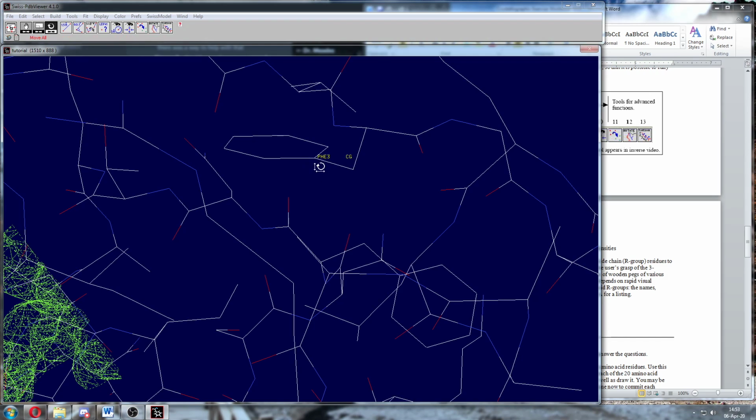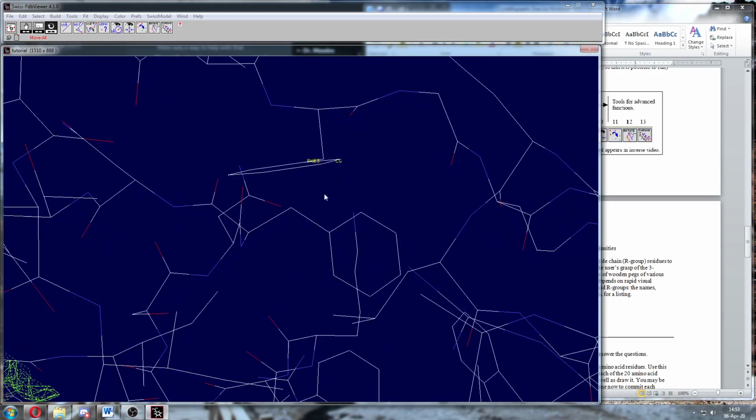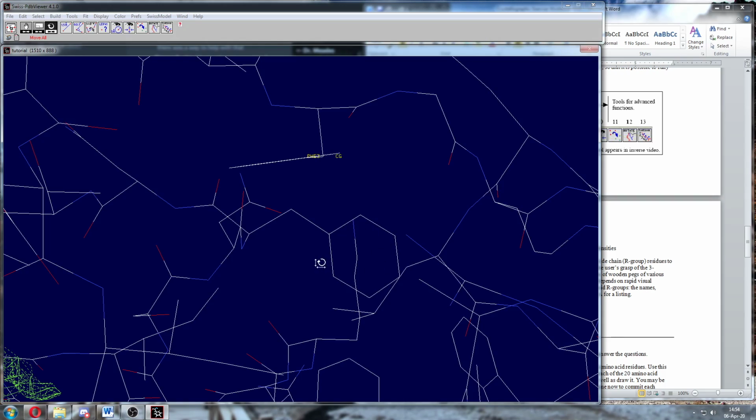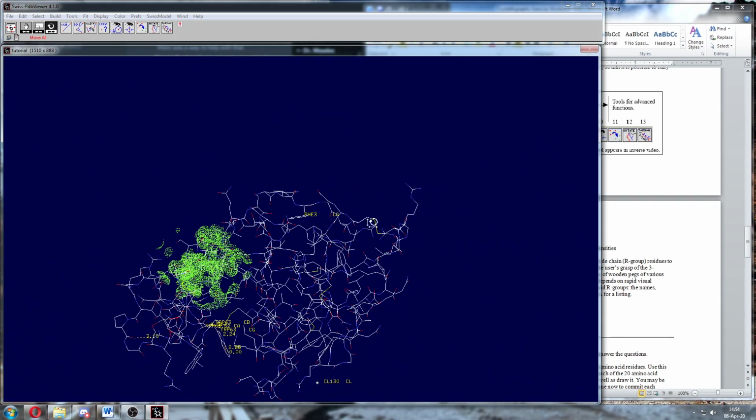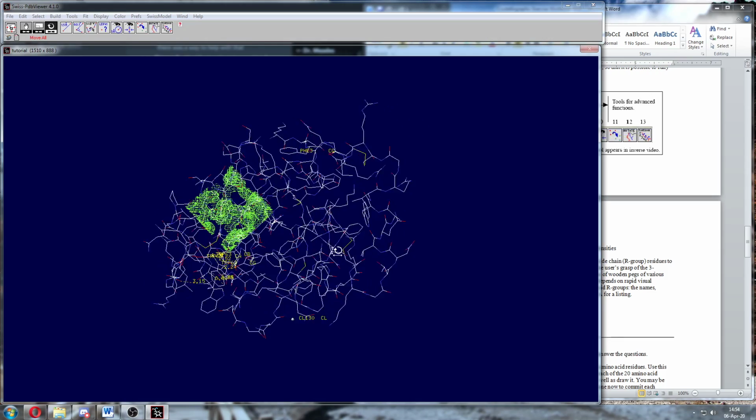If you label it incorrectly, guess again. Right? Doesn't make any difference. So I want you to do 10 of them that way. Find 10 unique amino acids that way. Happens to be another phenylalanine right behind it. Right? So find 10 that way. Here's an arginine over here. Right? Here's a glutamine there. Here's another arginine down here. You found this proline for me already once. So go through and find 10 that way.